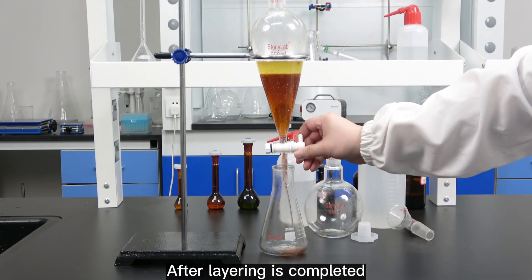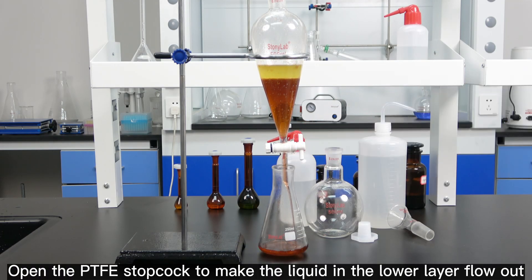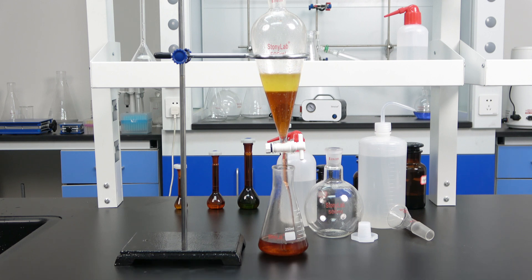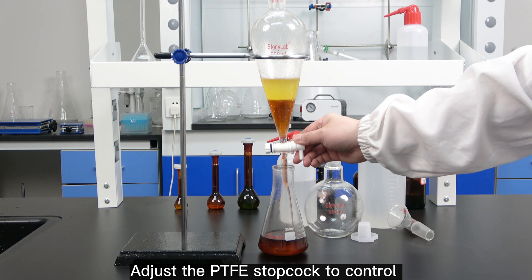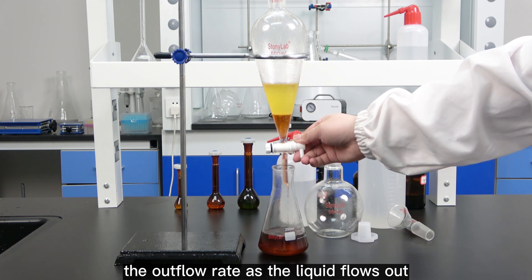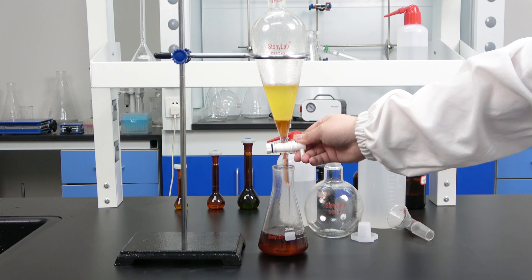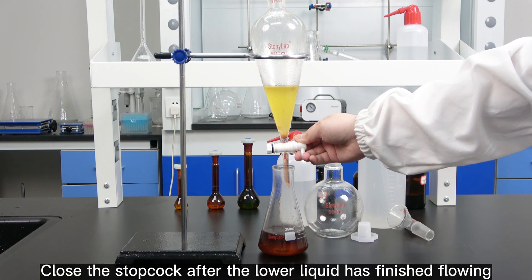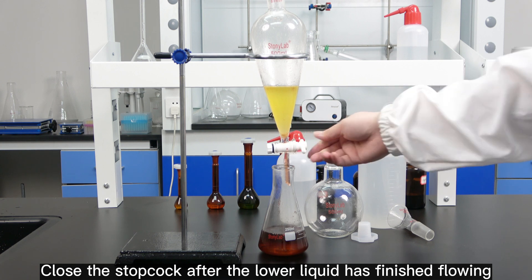After layering is completed, open the PTFE stopcock to make the liquid in the lower layer flow out. Adjust the PTFE stopcock to control the outflow rate as the liquid flows out. Close the stopcock after the lower liquid has finished flowing.